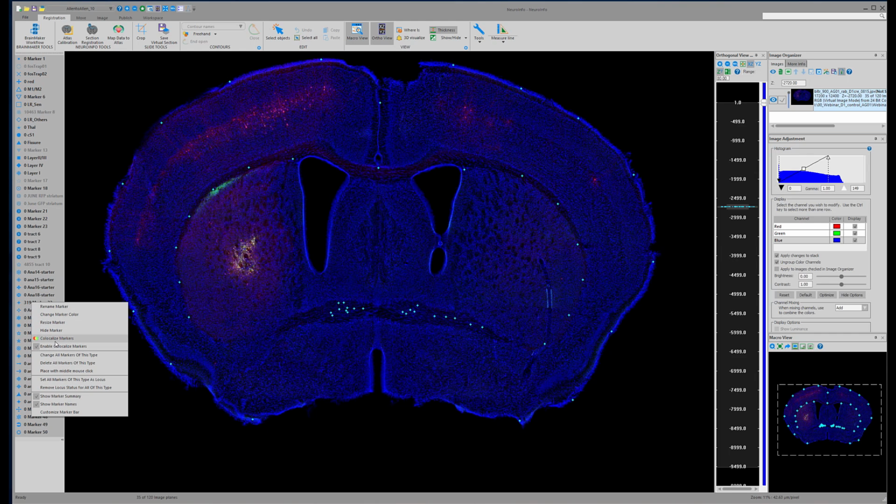We typically get less than 100 microns. So it's usually about 80 microns accuracy. And considering that neurons are some 25 microns in diameter typically, that's about 4 neurons. And I think that's fairly accurate.